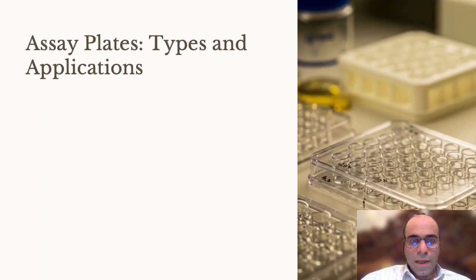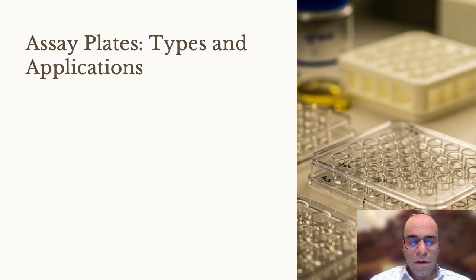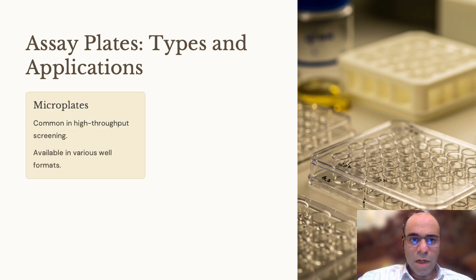Okay, let's see assay plates and their types and applications. Laboratory assay plates are essential components that directly influence immunoassay performance, sensitivity, and reproducibility. Selection should be based on specific application requirements. Here are three parts for that. The first ones are microplates.